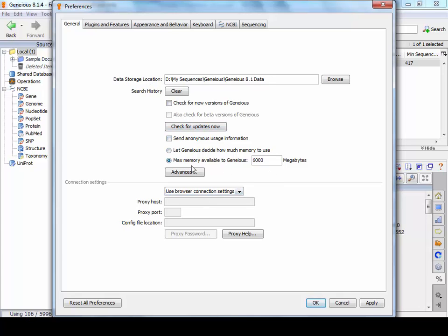In addition to this, when you first load up, this will say 1000, so it'll only have one gigabyte of RAM, which makes Geneious quite slow and fail on a few jobs. Most computers will have at least four, so you can take this up to 3000. If you have 8 gig, you can take up to 6000 and so on.